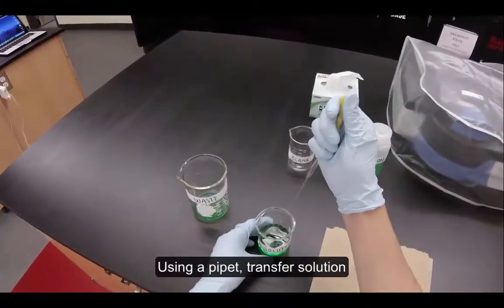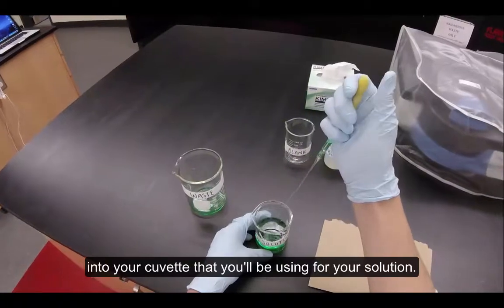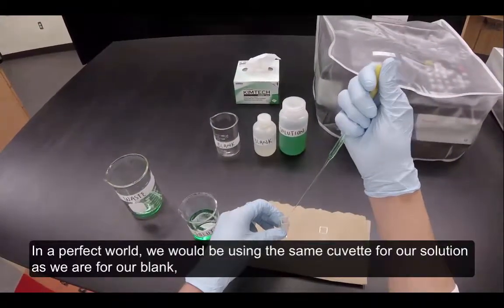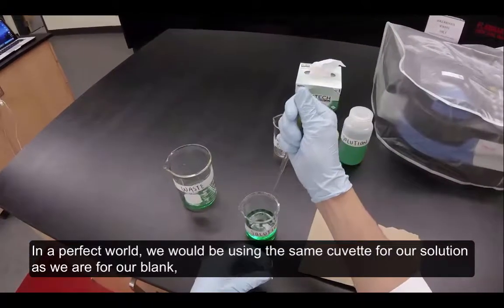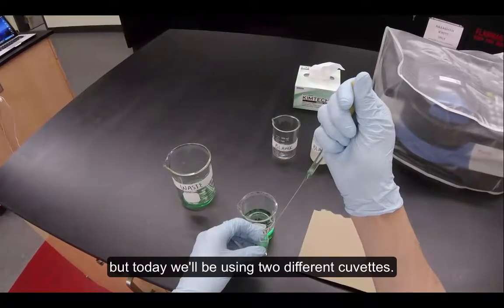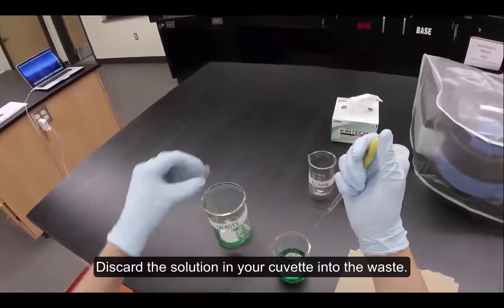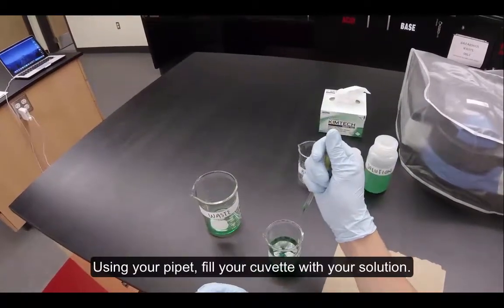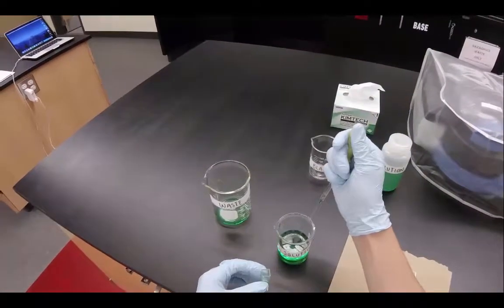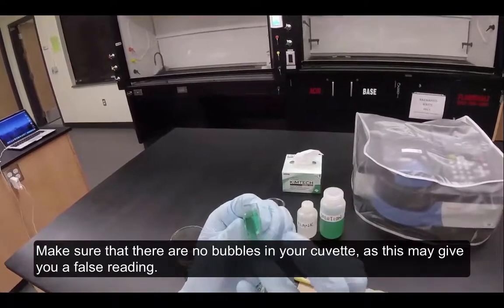Using a pipette, transfer the solution into your cuvette. In a perfect world, we would be using the same cuvette for the solution as for our blank, but today we'll be using two different cuvettes. Discard the solution in your cuvette into the waste, then using your pipette, fill your cuvette with your solution. Make sure there are no bubbles in your cuvette, as this may give you a false reading.